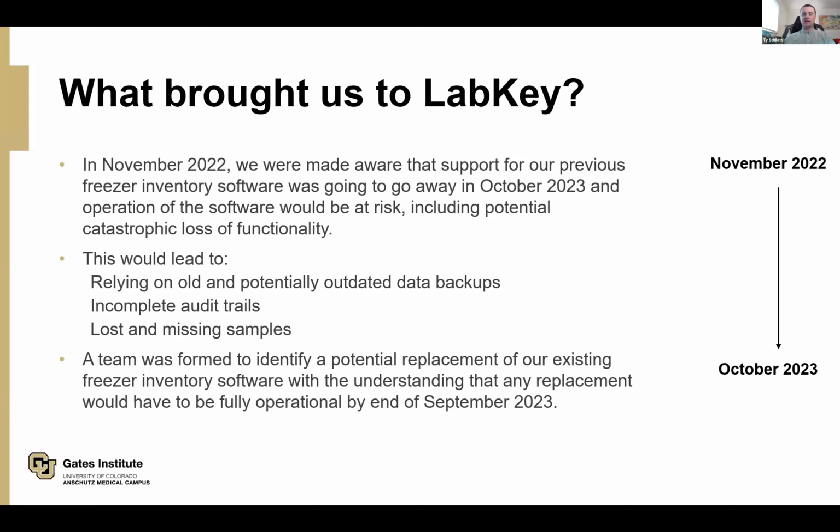We would have to reach out to our IT team and have them reset that server before we could go back in and complete the work we were doing. It also meant that if it crashed during a task, everything you hadn't saved would be lost or potentially corrupted. That's something you don't want to happen when you're working in these LN2 freezers, because then you have to go digging back in there and figure out what the last thing saved was.